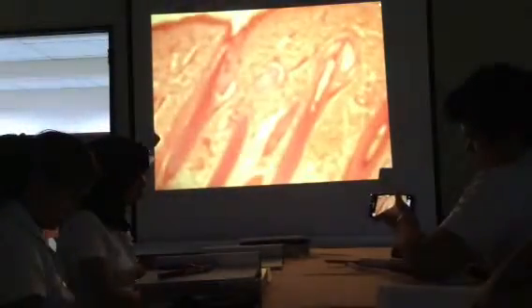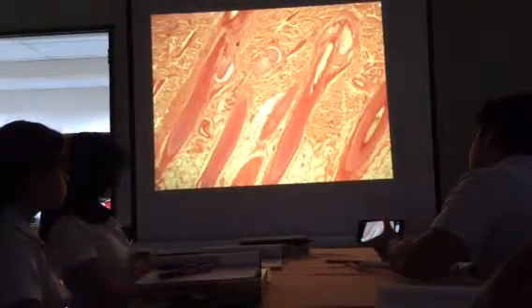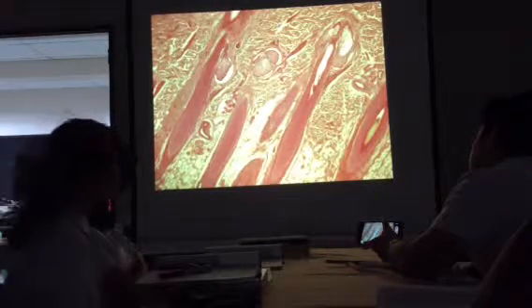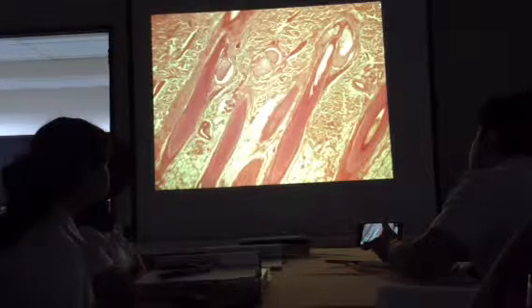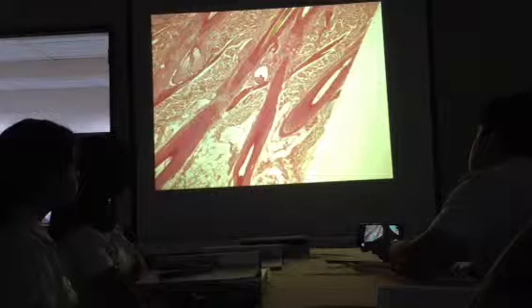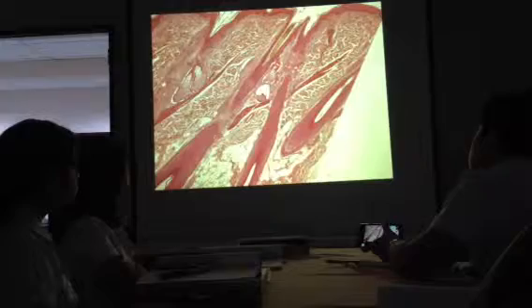Next slide is the scalp. Just to check if you have remembered something. Identify the structures pointed. Sweat glands. Very good. Sweat glands. So, we're looking at the histology of the scalp. We should be able to see the roots of the hair, which are called the hair follicles. Okay, those are the hair follicles.